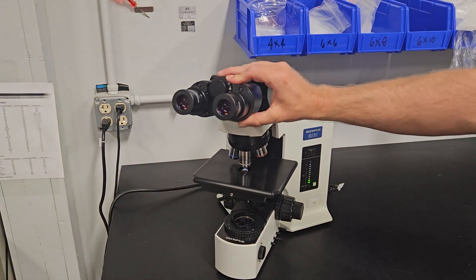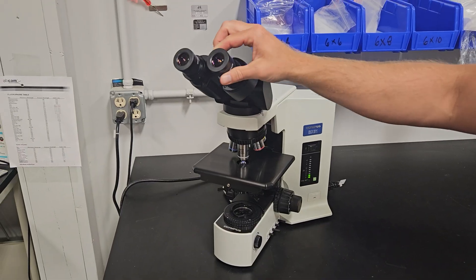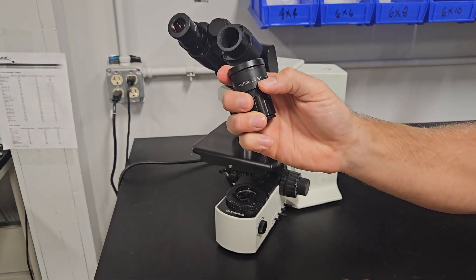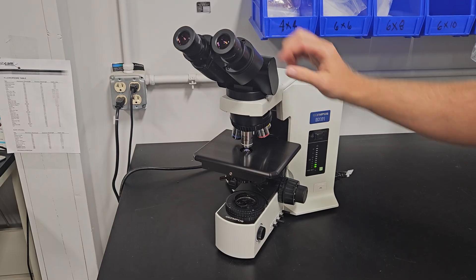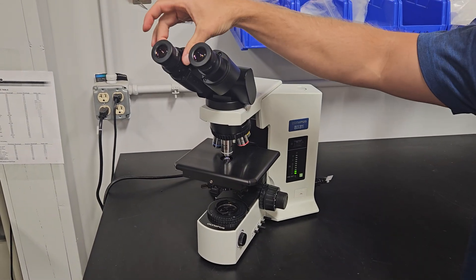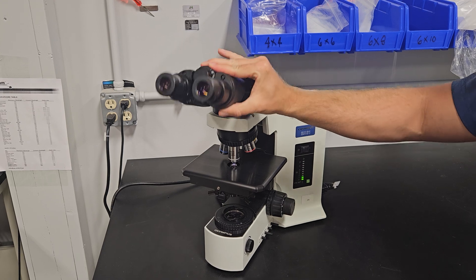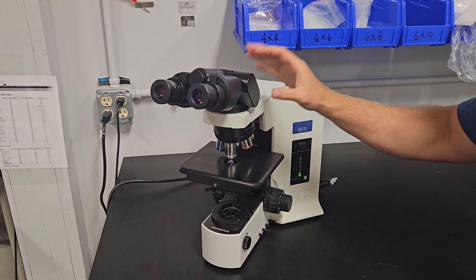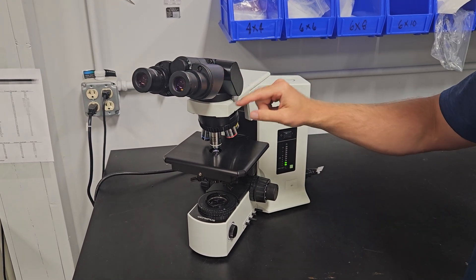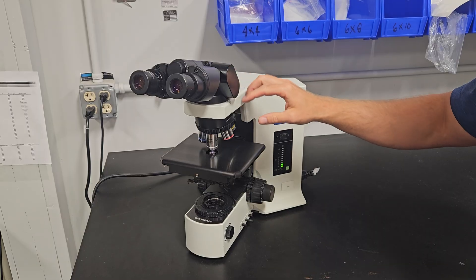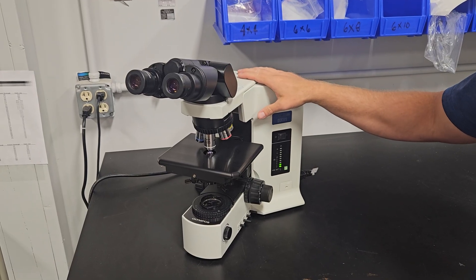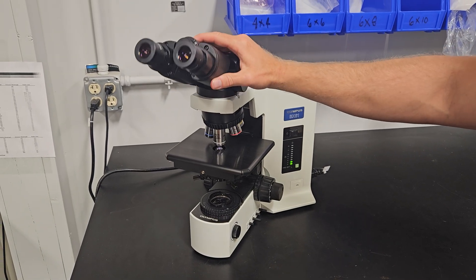So first, we have a tilting head on this scope, 10X by 22 millimeter field of view eyepieces. We'll put some rubber eye guards on here for comfort. You have a diopter tube on this side, nice tilting feature. You can put a trinocular head on here, you might have a fixed binocular head, or you might have an intermediate piece underneath here that sends light to the camera. We call it a U-TRU.